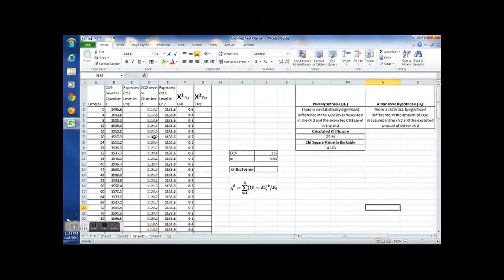This indicates there was no chemical reaction going on causing any change in carbon dioxide in the atmosphere. These fluctuations are probably just the way the machine works.